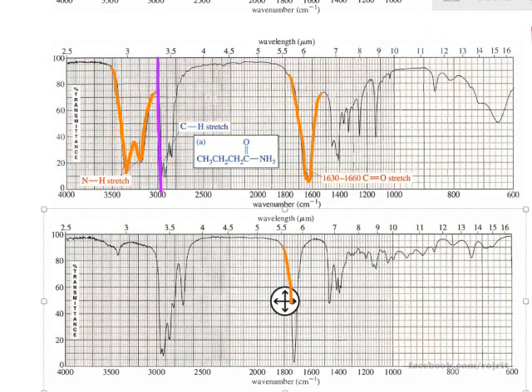What you can see is a carbonyl group at 1700 something, and you also have peaks around 2700 and 2800. So this is an aldehyde, for example, and with nothing beyond 3000, this is a saturated aldehyde.